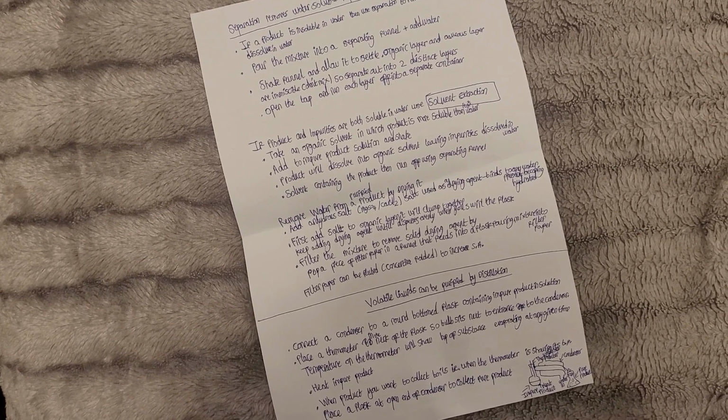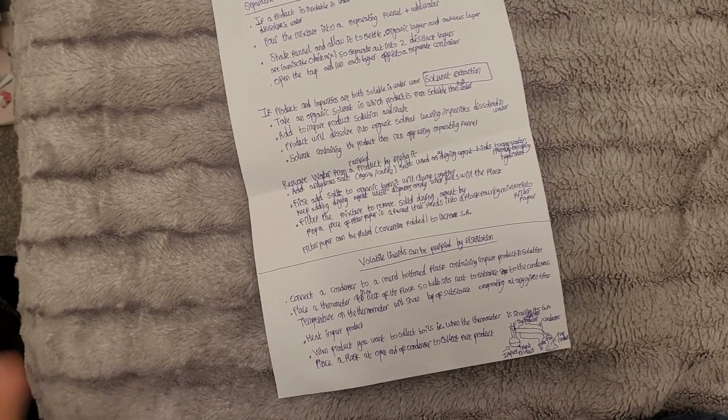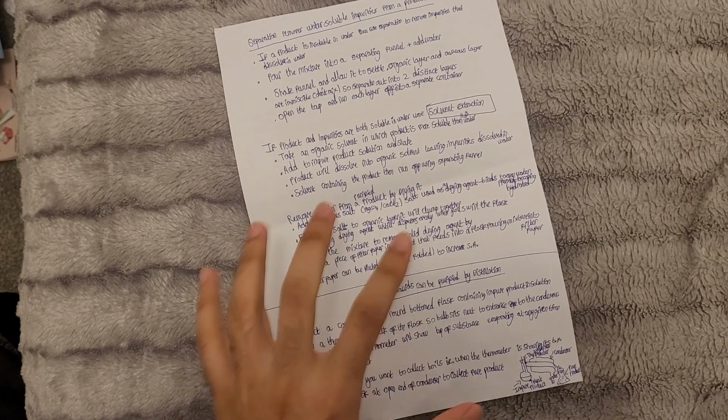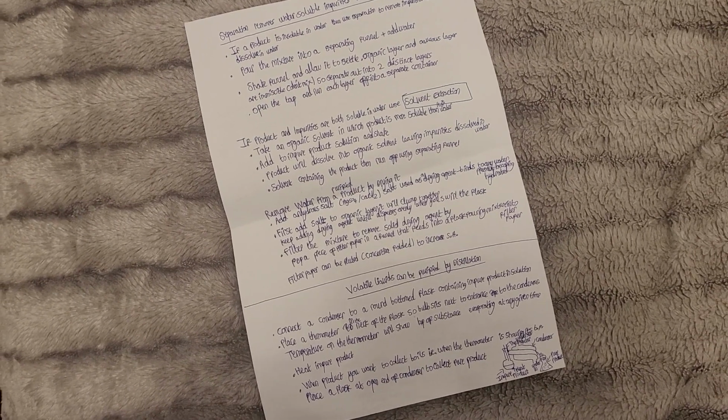First thing we want to do is add the salt to the organic layer, and what will happen is that it will clump together. So we want to keep adding the drying agent until it disperses evenly. Once it disperses evenly, that's when you swirl the flask.